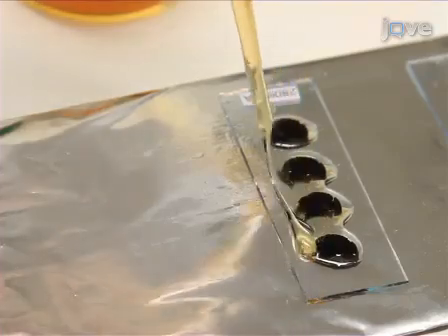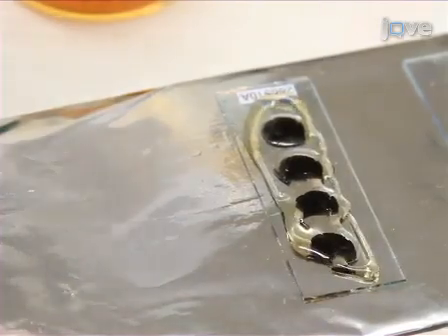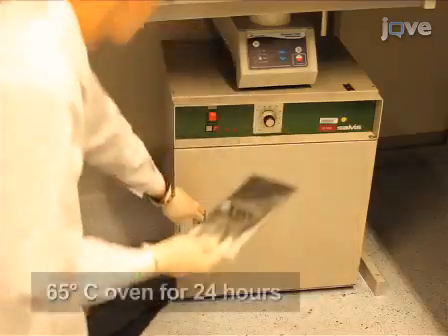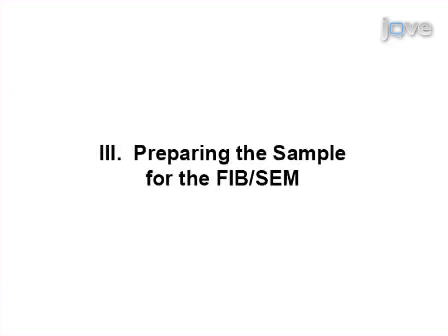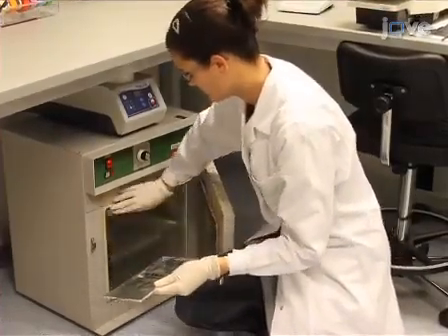Put as many sections onto the slides as possible, but take care not to overcrowd the slides. Make sure an identity label is also placed between the microscope slides. Place the slides in a 65 degrees Celsius oven for 24 hours. The next day, remove the samples from the oven.